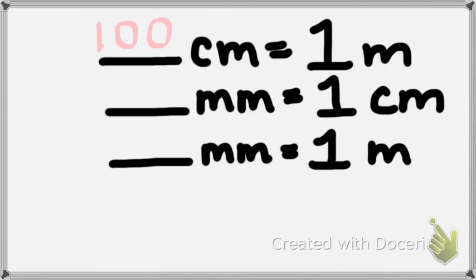Okay, there's a ruler somewhere on your table that you and your lab partner can look at. The lines, the big lines with the numbers on them, are the centimeters. I'll pass one over to Ruth Mata because she can't reach that far. There we go. Okay, so great. The next question is, now we have a centimeter. You can see it on the ruler. How many millimeters are in a centimeter? 10. And millimeters are the little black lines. Just a quick caution, make sure you always use the metric side of the ruler.